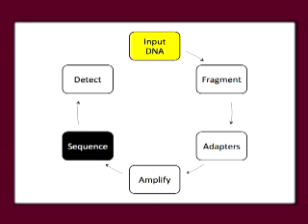Dr. Martis has given you a good idea about the differences in production. Now I'll tell you about the differences in technology, and you can see the machines. Both technologies have some similarities. At the beginning, we start with input DNA.